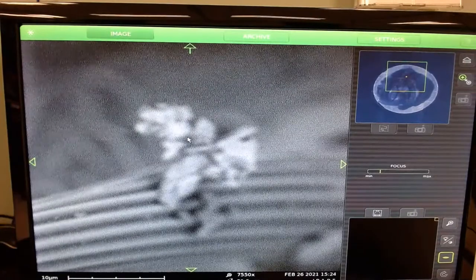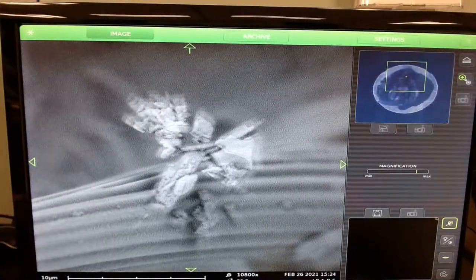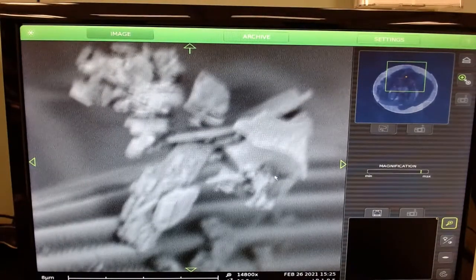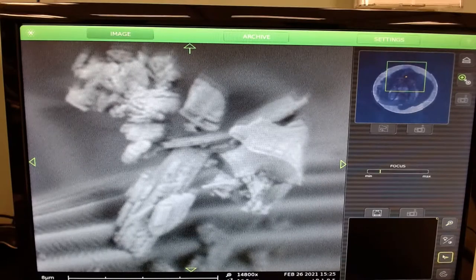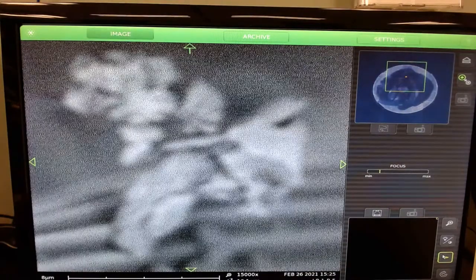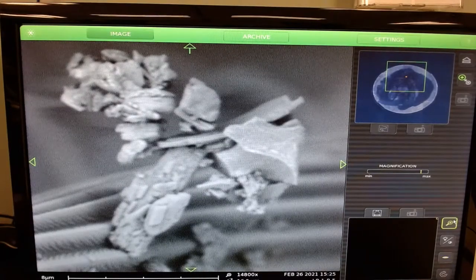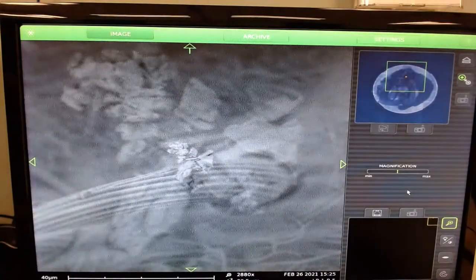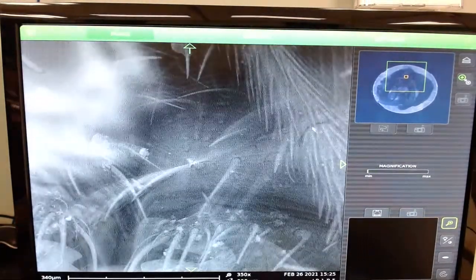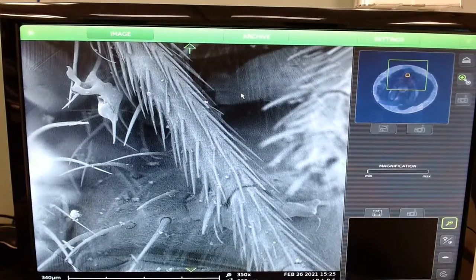So I don't really know exactly what I'm looking at, but it's really small. Have you been able to get a shot of the eyes of the fly? I have not. I think they're too far over the edge, but I can try and get over there. Yeah, that looks good. When you zoom out, you see all the little spikes. I think this is an antenna, that one right there. Neat. Very cool imaging. Let's go on a search for the eye of the fly.